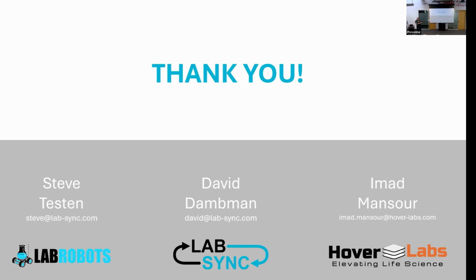It's very different between designing a lab in a big pharma versus, let's get some equipment off eBay and get running really quickly, with a robot loading samples to run 24/7 on some analysis machine. So it can go very quick, but generally think of it more like a construction project, where there are lead times and a lot of management of moving into the lab, getting air and power hookups that are appropriate for the instrumentation. It's a lot like a lab build-out, and then it's more complex because you've added robots and software integration and all of that.